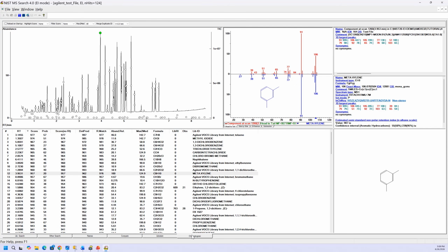And again, I want to reemphasize, we've just been in the Chromatogram tab. When we opened up the files, we're just doing the processing, this integrated AMDIS within Chromatogram. There's a lot of other tabs here, and we'll discuss other ones and other parts of the videos because they're very important too. But this is the basic one that you need to know how to do for identifying unknowns in GCMS files.